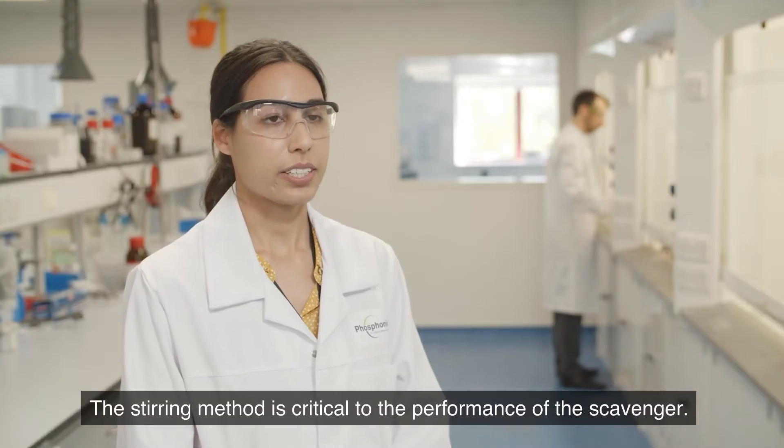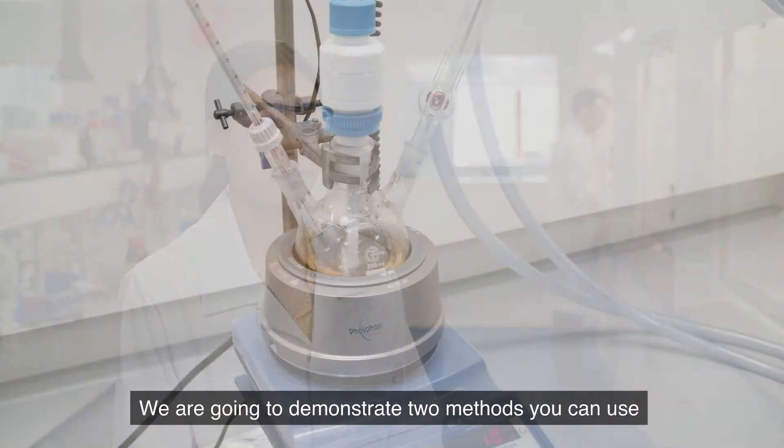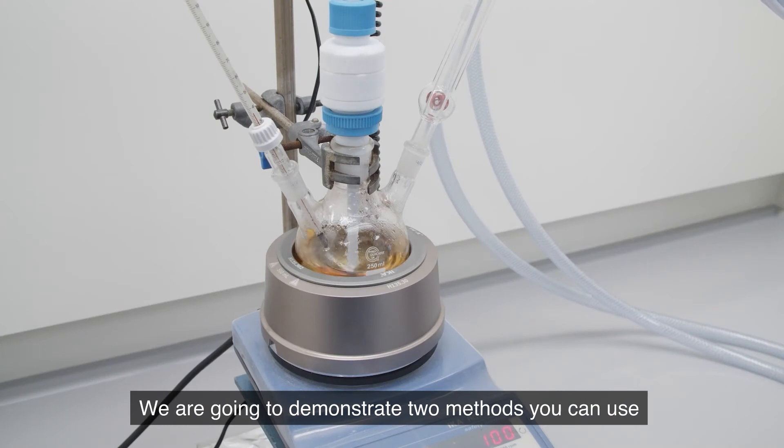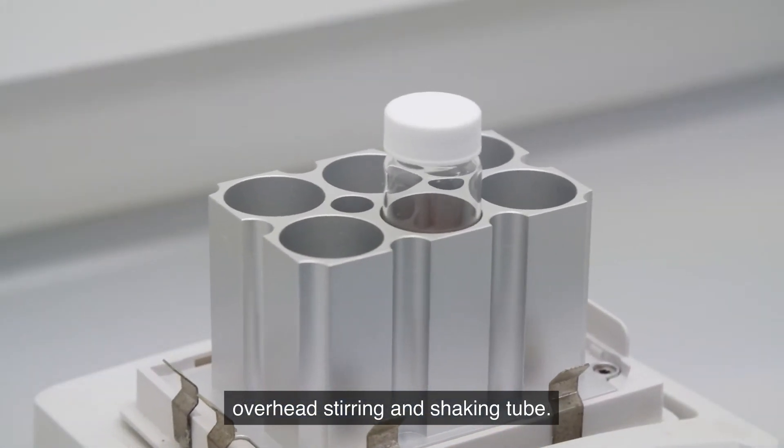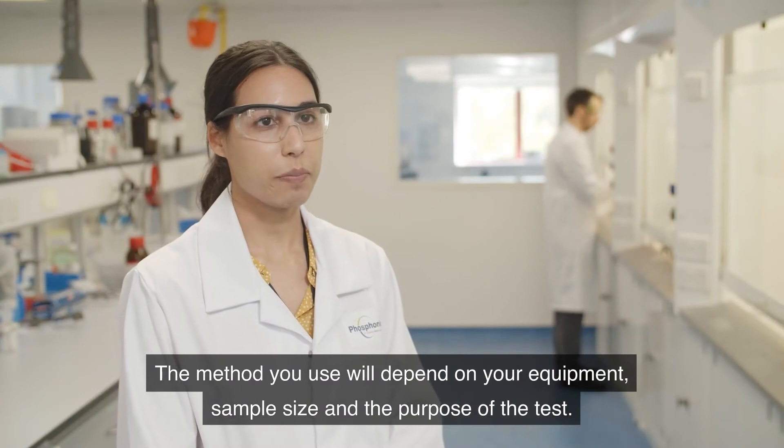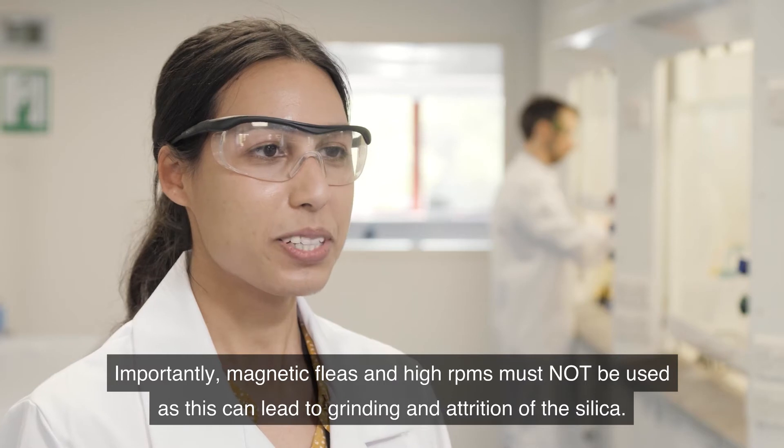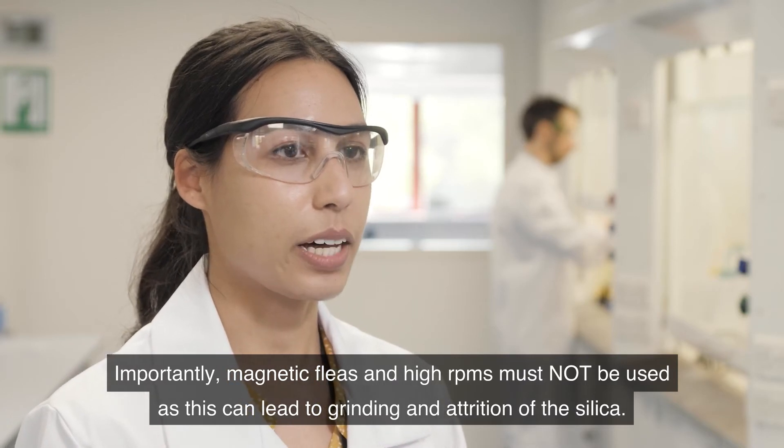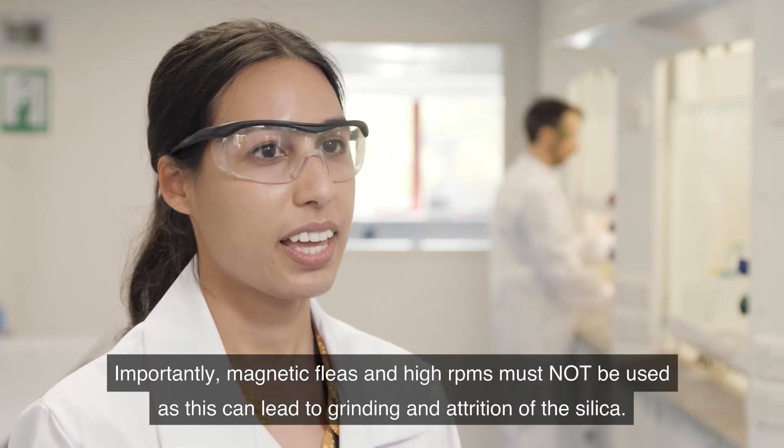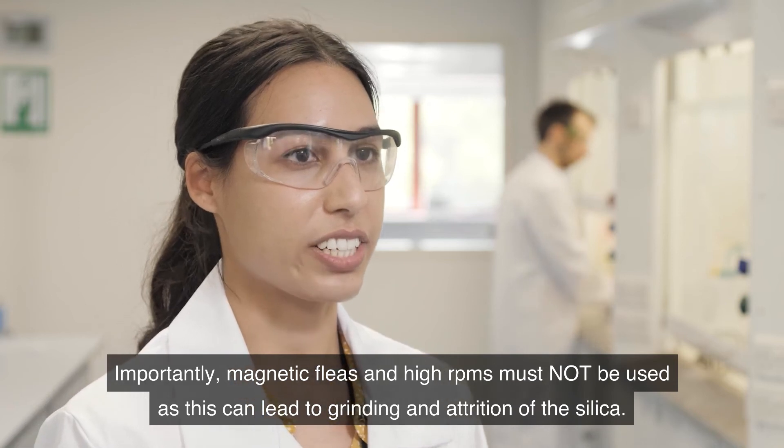The stirring method is critical to the performance of the scavenger. We are going to demonstrate two methods you can use: overhead stirring and shaking tube. The method you use will depend on your equipment, sample size and the purpose of the test. Importantly, magnetic fleas and high RPMs must not be used as this can lead to grinding and attrition of the silica.